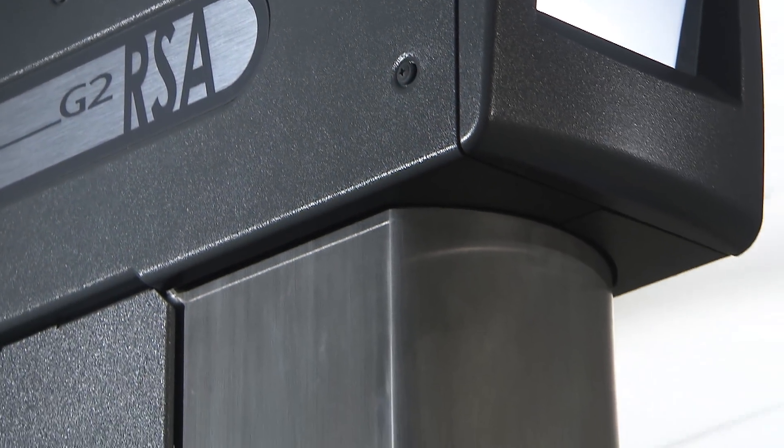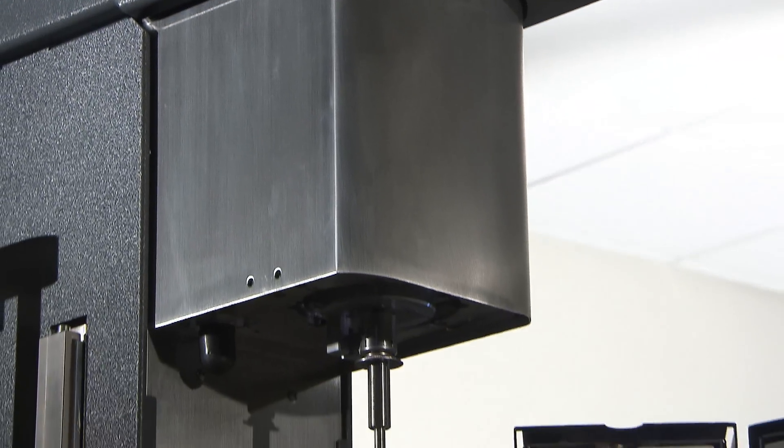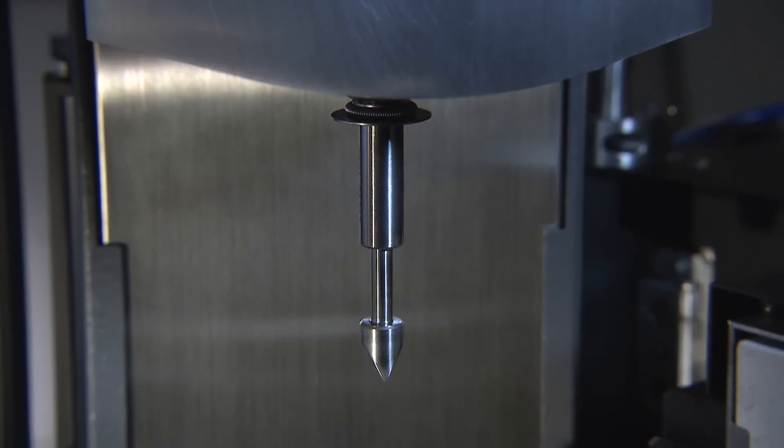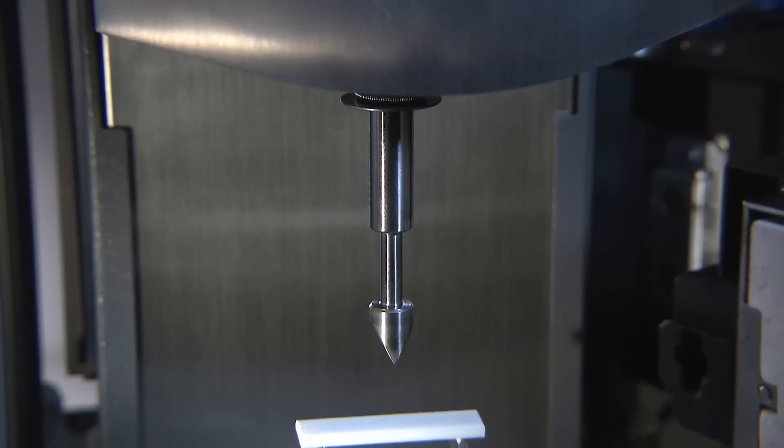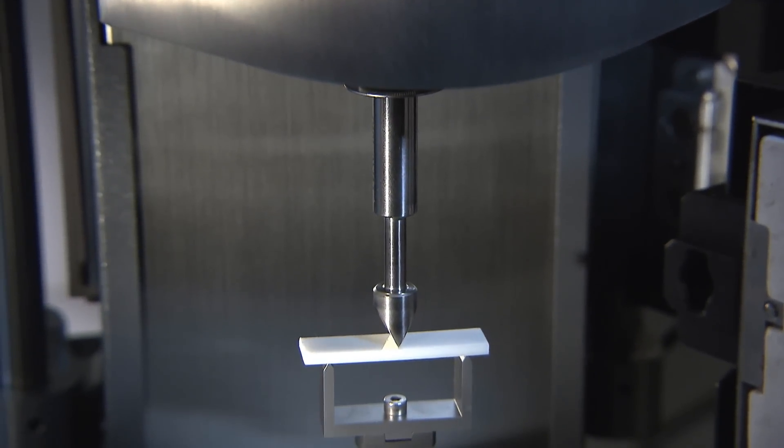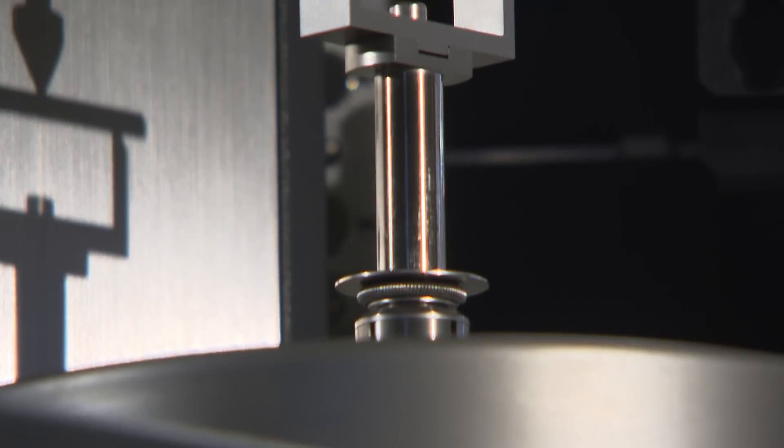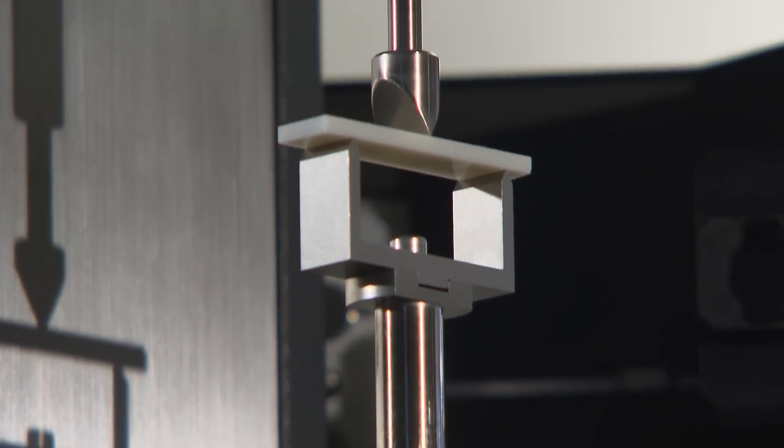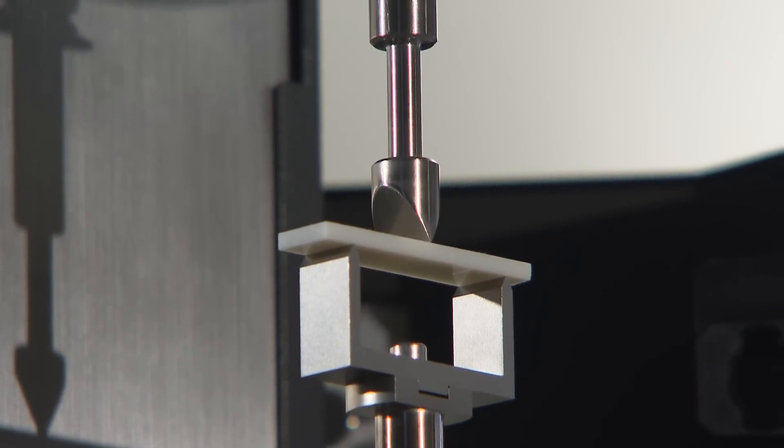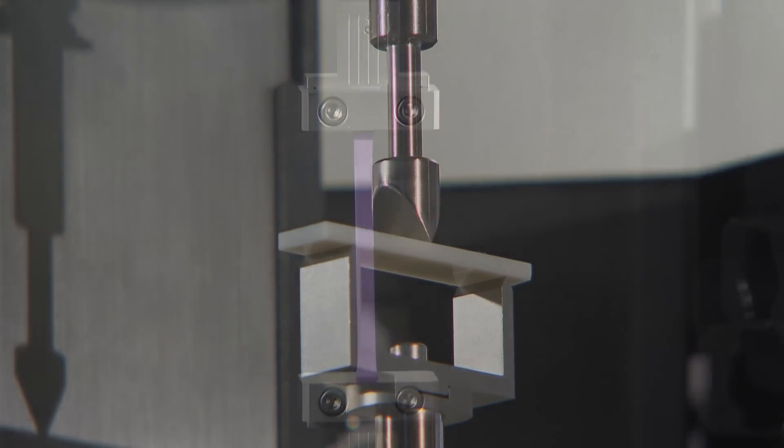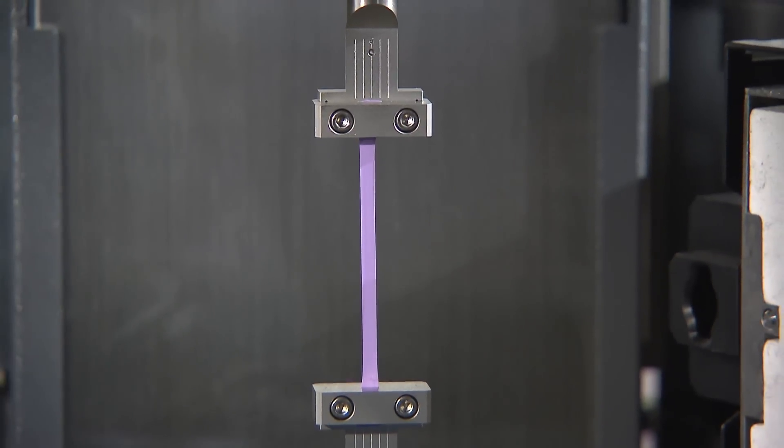The RSA-G2 force transducer is mounted to the frame via a linear slide and micro-stepping motor for fast and precise independent vertical positioning to an accuracy of 0.1 microns, speeds of 0.05 microns to 20 millimeters, and a large travel range of 100 millimeters.